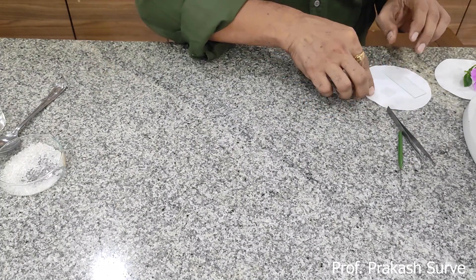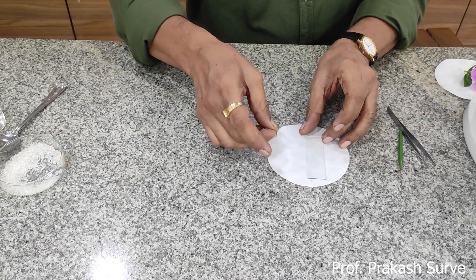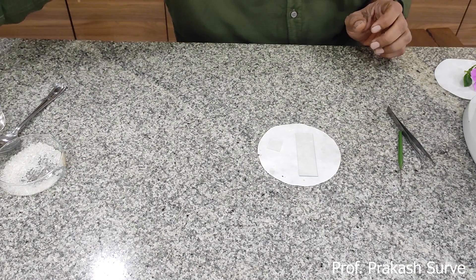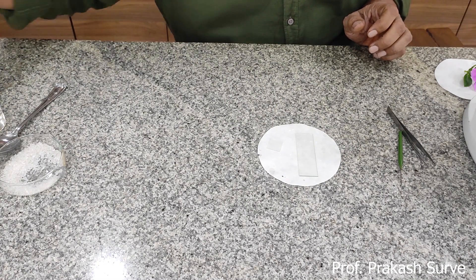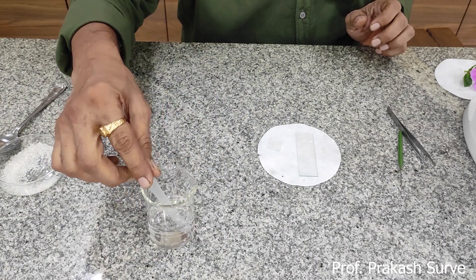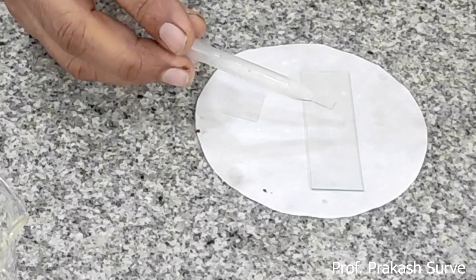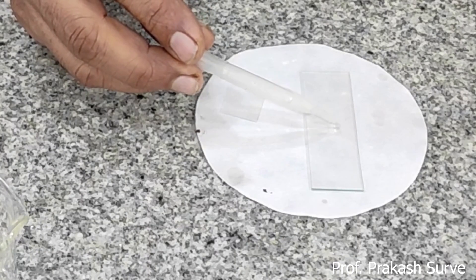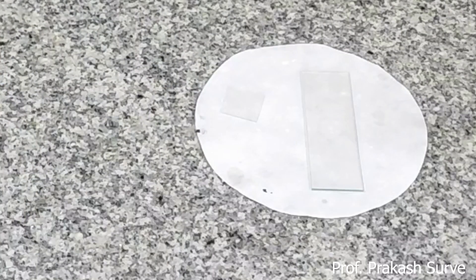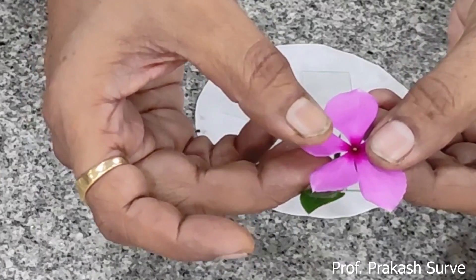Now take the slide. On the slide we will take the concentrated sugar solution — take one or two drops of this sugar solution at the center of the clean slide. Now we will take the flower, which is a fully developed flower.